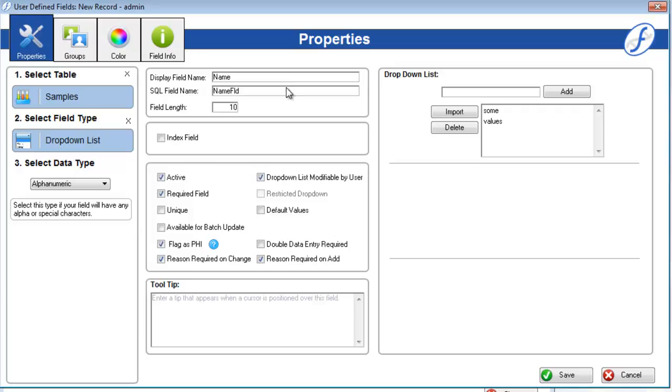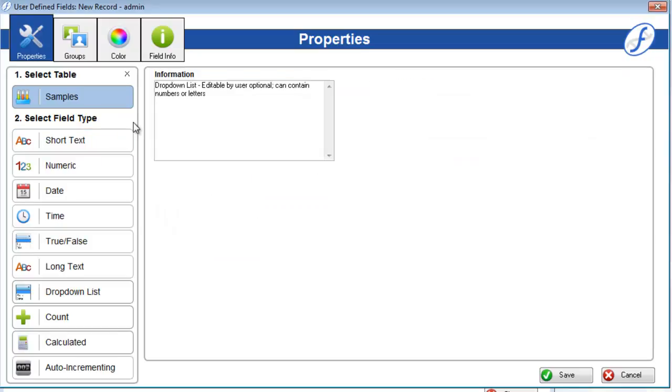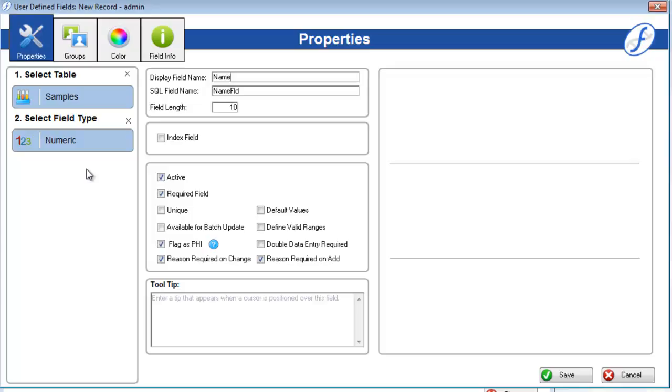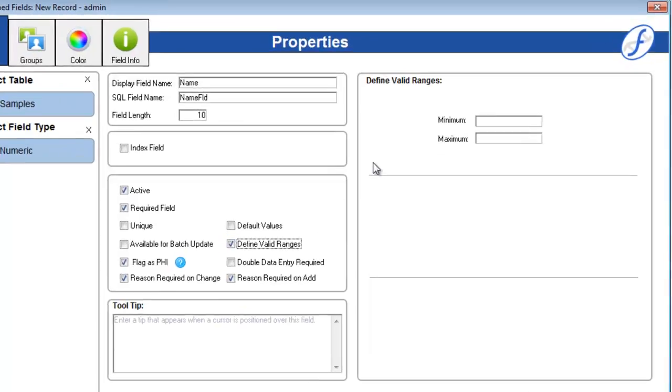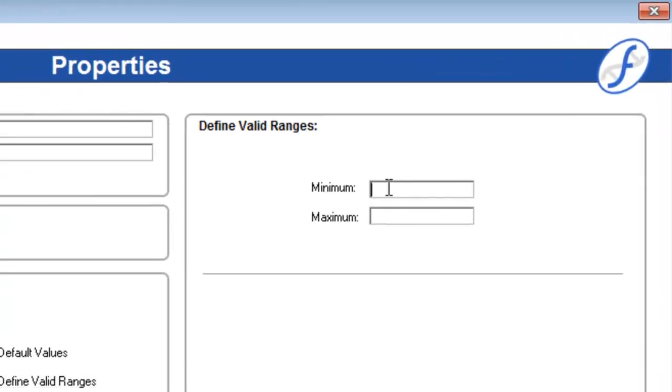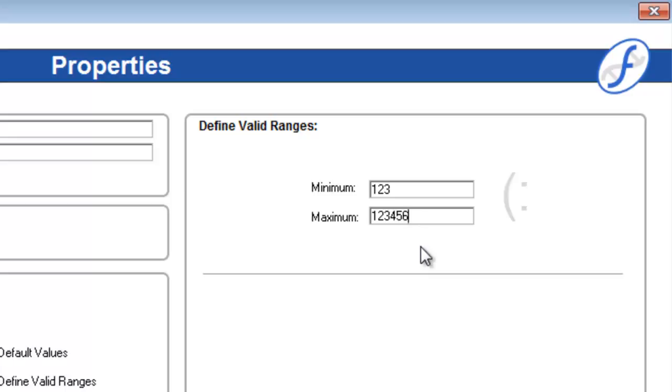Let's create a numeric field now to learn more about how the three boxes on the right work. Check on define valid ranges. This activates the top right box so we can enter a minimum and maximum value for the field. Let's enter a minimum value of 123, and a maximum of 123456. If a user enters anything under the minimum or above the maximum, it will not be accepted.